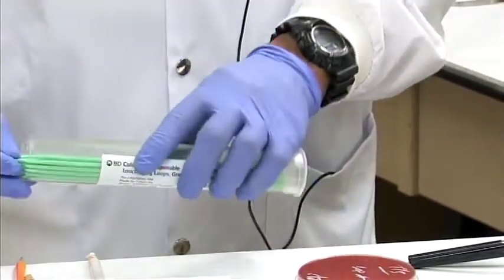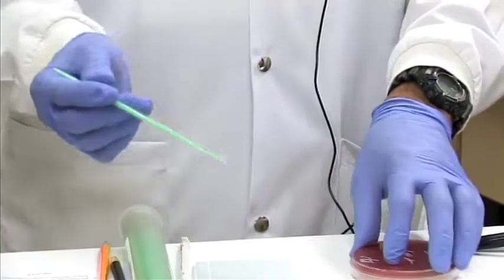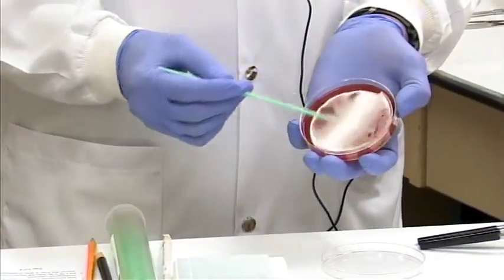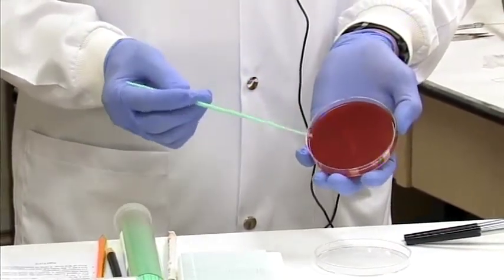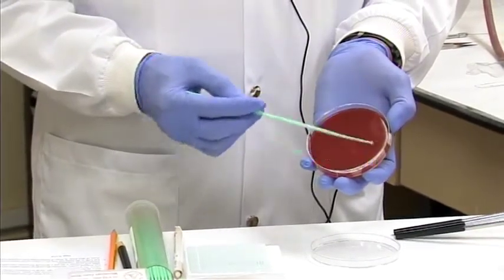Then we go on to streak with our disposable loops. Loops come in different sizes, and they're all color coded. Again, this is sterile, you don't have to flame and cool. Simply open it and streak your plate by pulling out 3 or 4 times from the pool. Then you can turn the loop over to the other side and streak out that first quadrant.